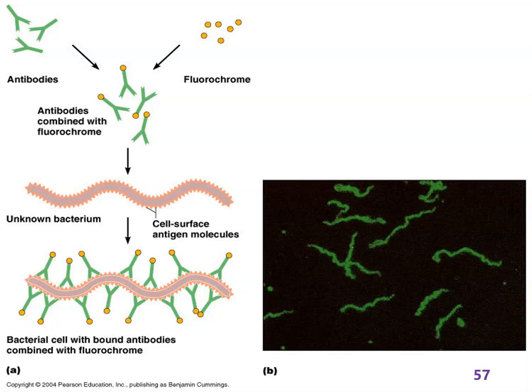Okay, so fluorescence microscopy is a type of light microscopy. Again, you're using visible light. It's a type of compound microscopy. You have an ocular lens, an objective lens, a condenser, different things like that. Bright field, phase contrast, and dark field are all different types of compound microscopy using light. So that's all light microscopy.